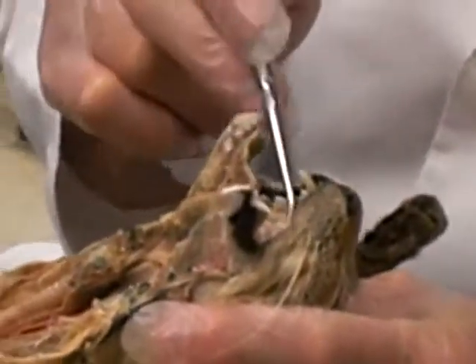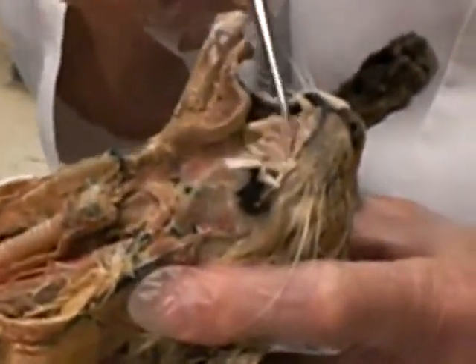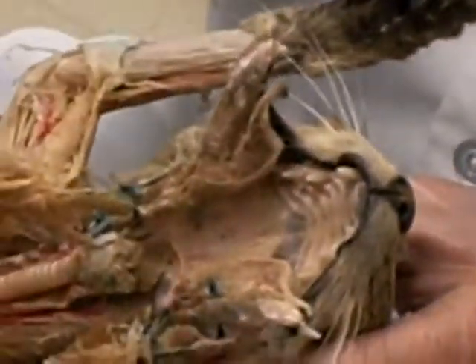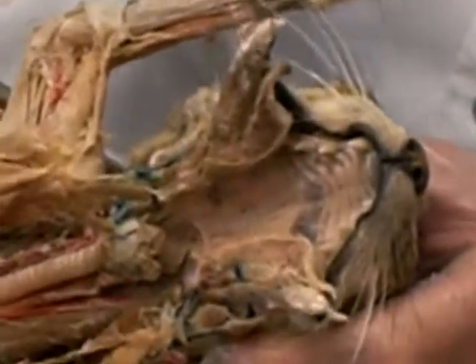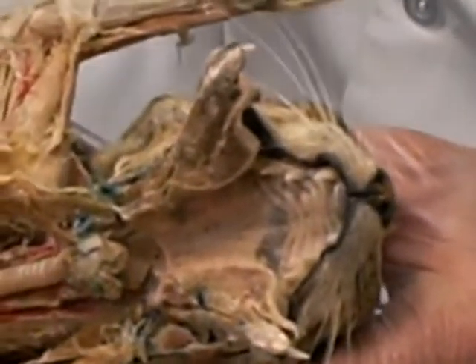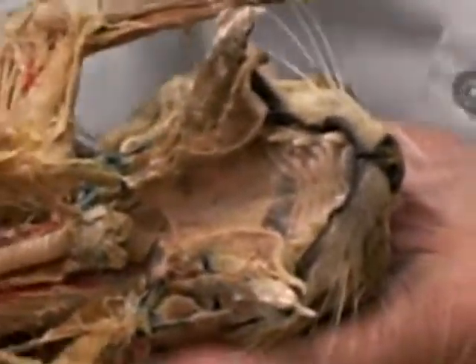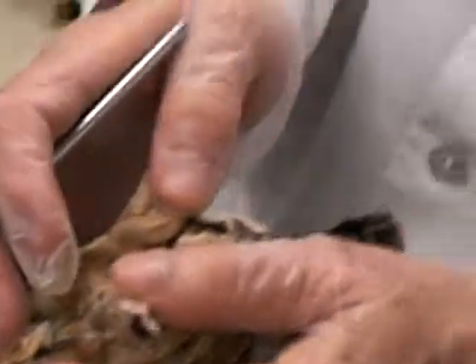Okay, then there's the oral cavity, there's the hard palate, it's hard. And in the cat, it has some ridges on it that, along with these really rough protrusions on its tongue, are used for grooming and also for rasping meat off a bone. If you're ever licked by a tiger or a lion, it can actually tear the flesh. That's probably your least worry, though, if you're being licked at that point.